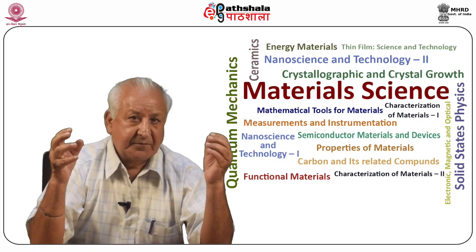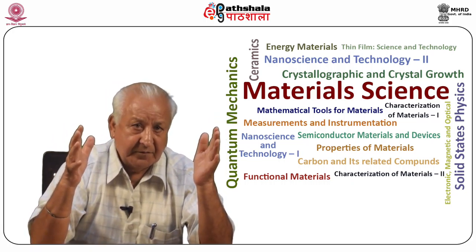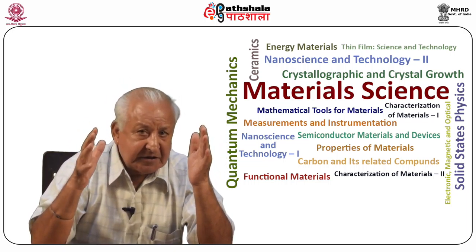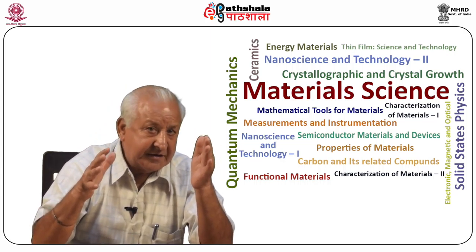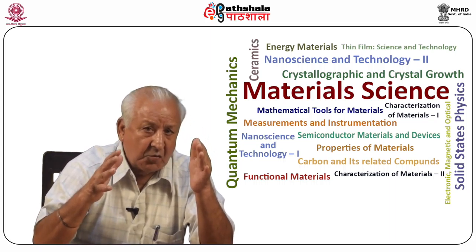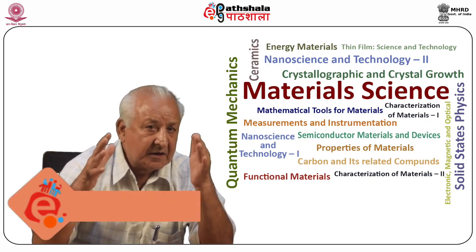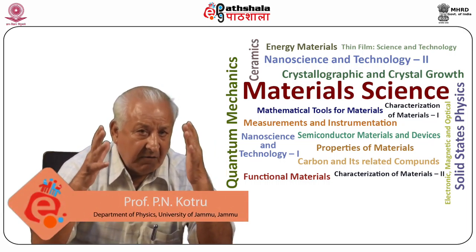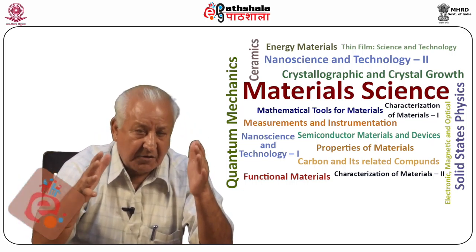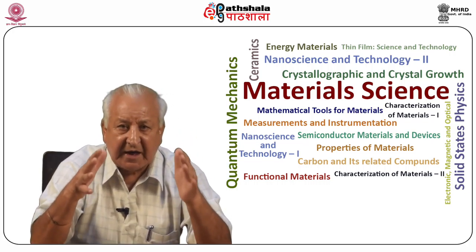So, students, let us summarize what we have learned in this module. We have learned about applications of electrons in the study of defects and homogeneity of crystals. We have also learned about the electron microscope and scanning electron microscope as tools for investigating crystalline solids. We have also formed a background of microanalysis by electrons. The electron probe microanalysis has also been described.